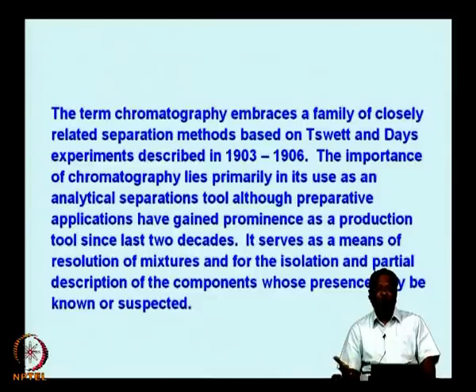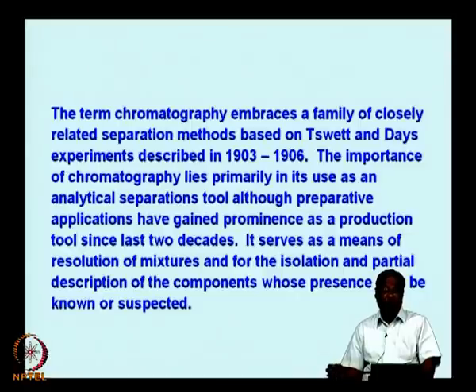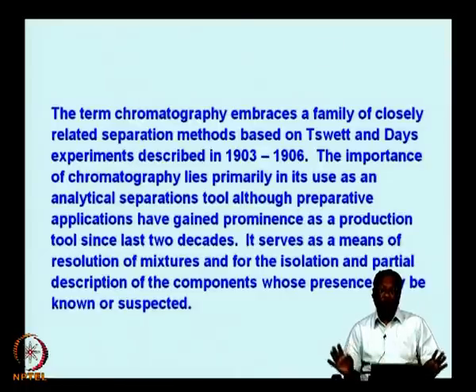You will appreciate that they are only 100 years old now, but the amount of knowledge and the amount of advances that have come through in chromatographic techniques is truly enormous and mind-boggling. So, the importance of chromatography lies primarily in its use as an analytical separation tool, although nowadays, in the last 15 to 20 years, chromatographic techniques have been used as a production tool, especially for high quality pharmaceutical products. Many of them are being produced using preparative chromatography.